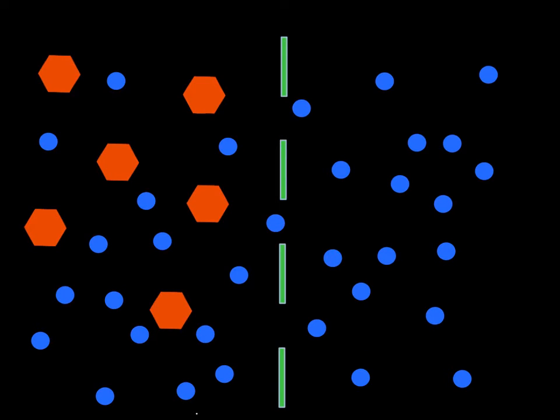As you know, all particles vibrate, and occasionally they knock into each other and bounce away. So these molecules here are all vibrating and moving around. Occasionally some of them can pass across a membrane through the pore that is there in the Visking tubing. So some water can go from right to left, and other water molecules from left to right, and so on.